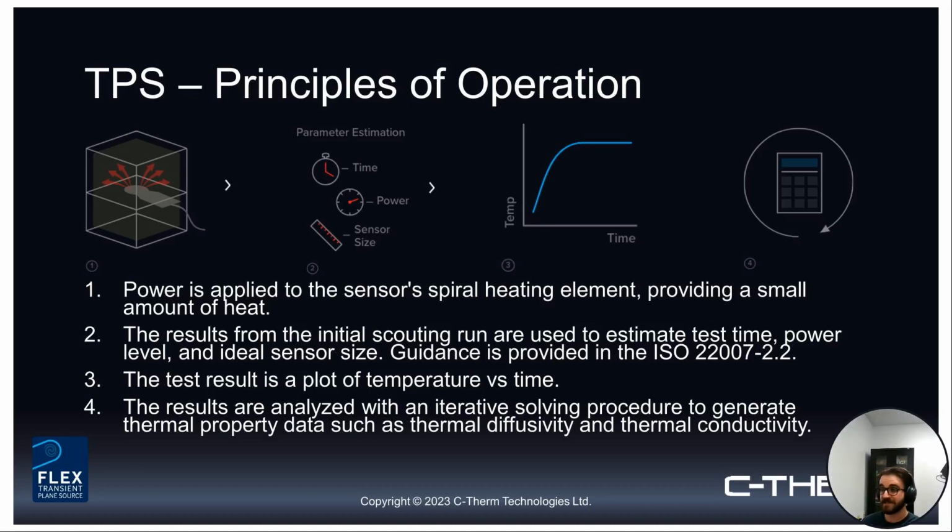Now with the TPS, it is not factory calibrated. The settings are a little bit not the same as what I described with the MTPS. And because of that, post-measurement, there is a verification process that you essentially have to run through. There are a series of checks that you need to ensure are validated. You may need to go in and do some data adjustments.